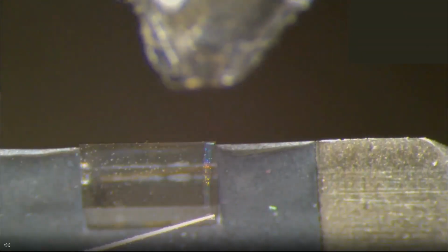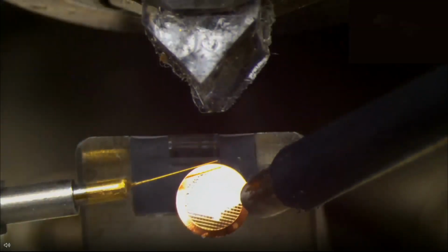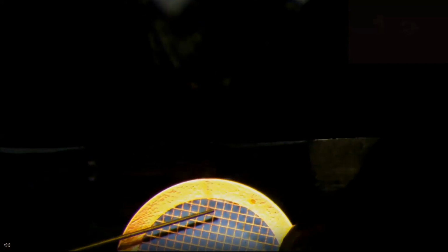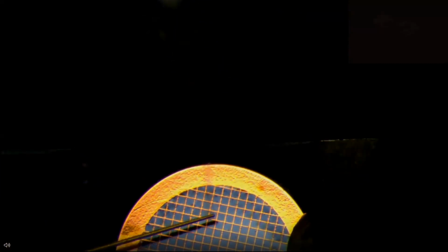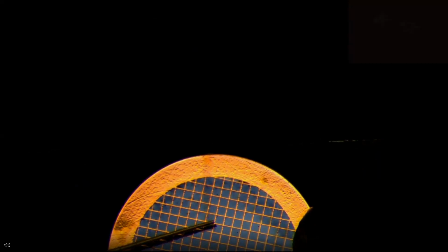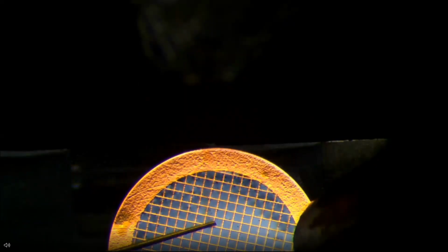The ribbon is moving towards the observer, and the conducting fiber is moved by turning the micromanipulator manually. Here you can see the fiber in the center. And on the right-hand side, we now move with the micromanipulator the grid into position and charge to lower the ribbon on the EM grid.